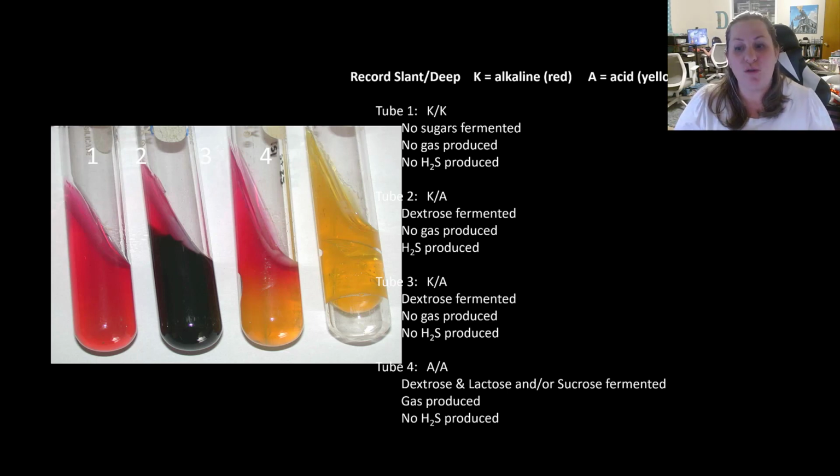You then get to use those charts along with this handwritten part that you go through in this PowerPoint with these tests on your final exam. This will allow you to know, well, if this test was positive, that tells me I've got this type of bacteria or these types. Then I do the next test to see what the next type is and so on, to where it narrows it down to one bacteria. It'll make a little more sense when I get to show you in person how it all works. But in the meantime, use this lecture to go through and fill in your notes that you get to use on that final.